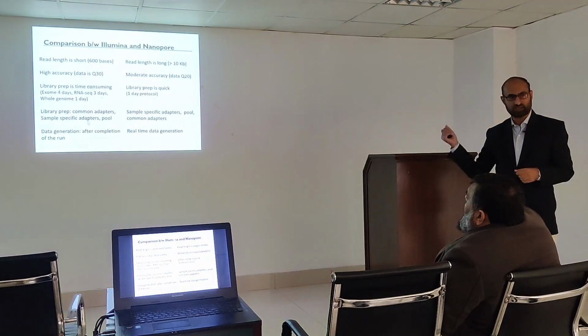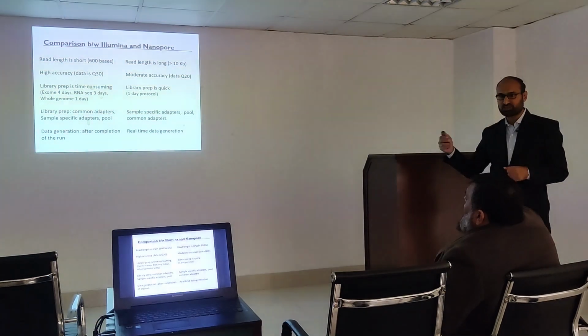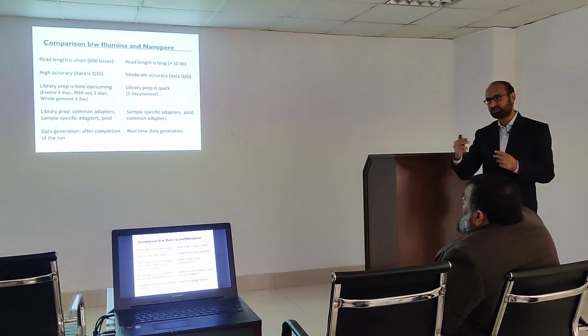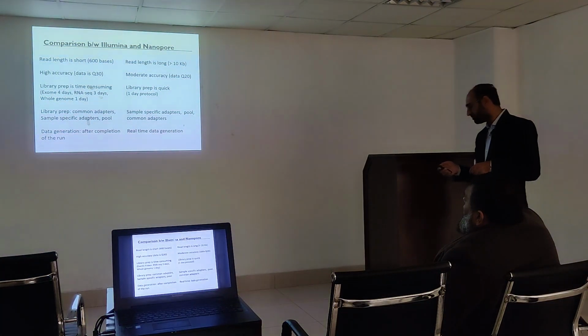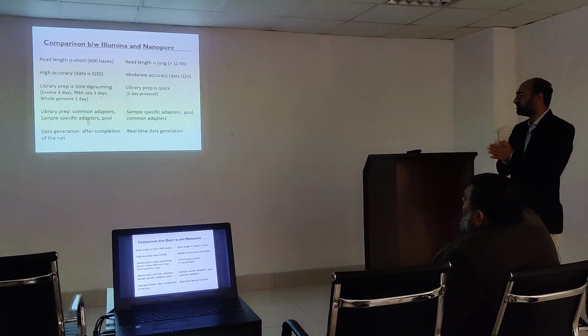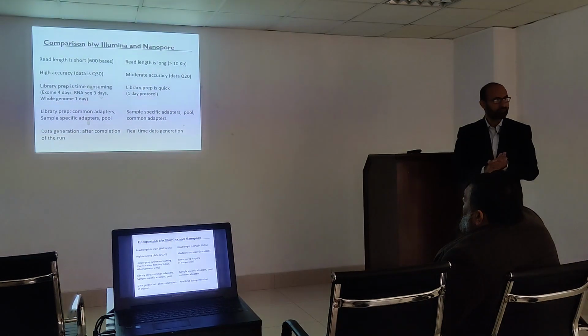Very detailed practical demonstration today. And each step is a full protocol. There are certain reagents, chemicals, buffers, which we have to add at any step to get the sequences. So far, I think this is very brief. If you have questions, we can discuss now.